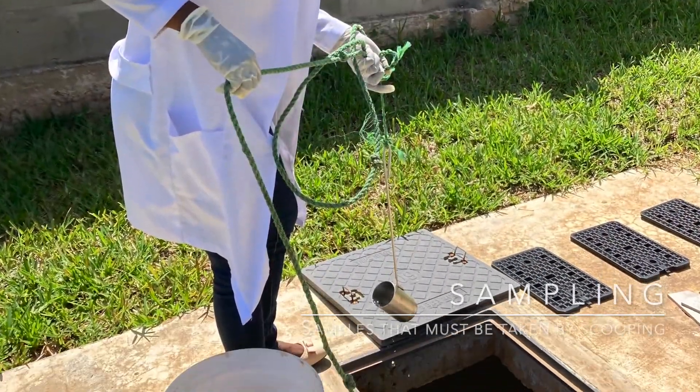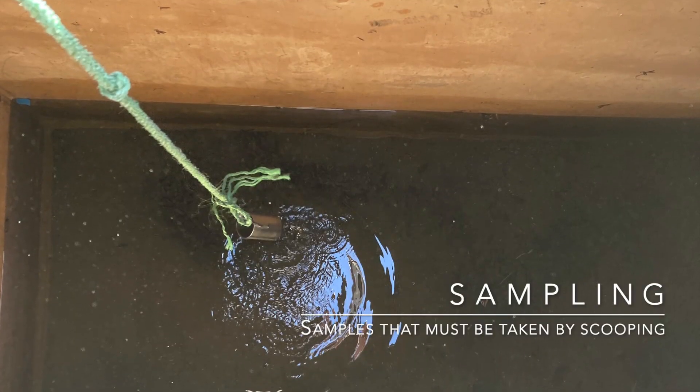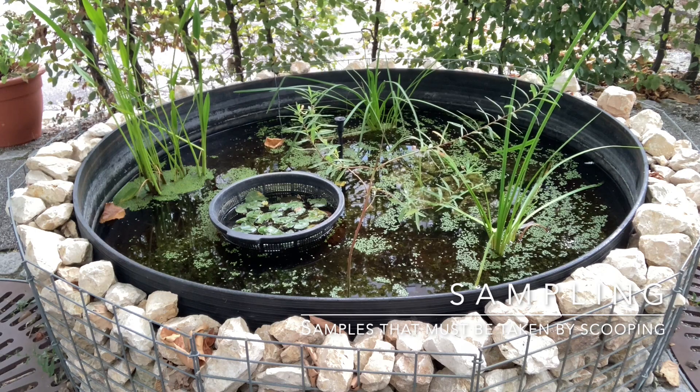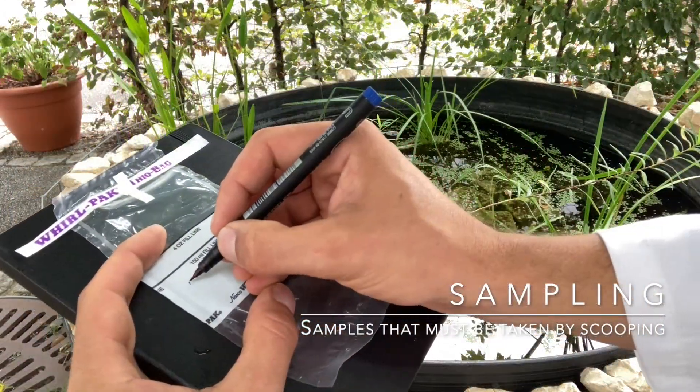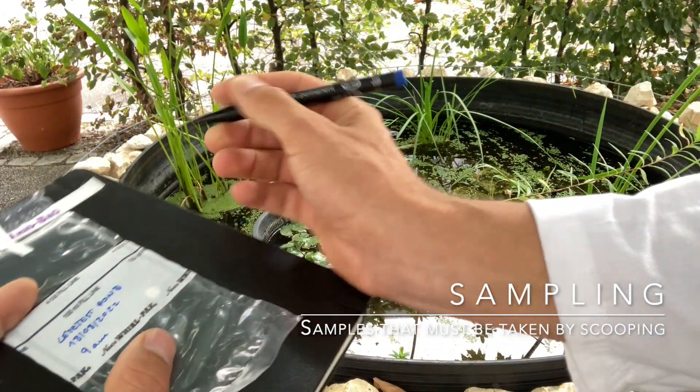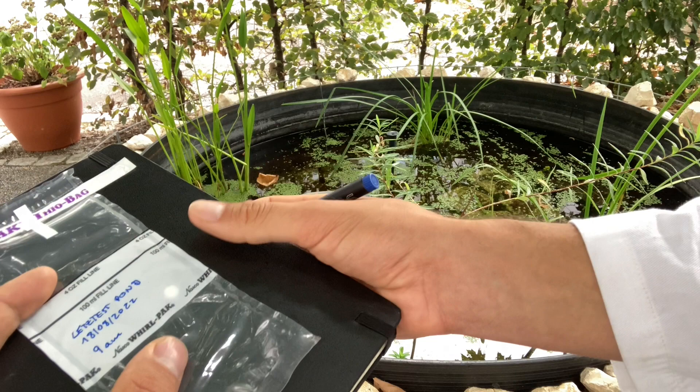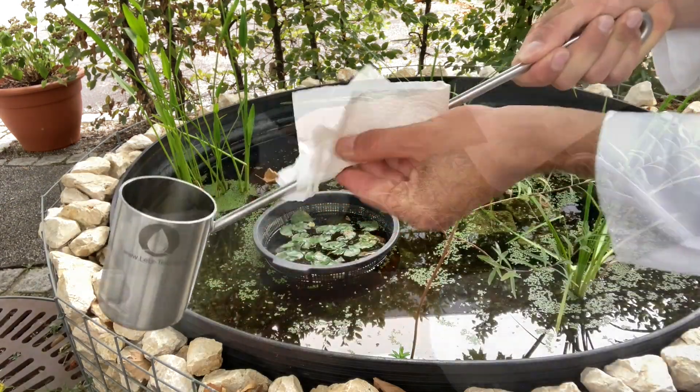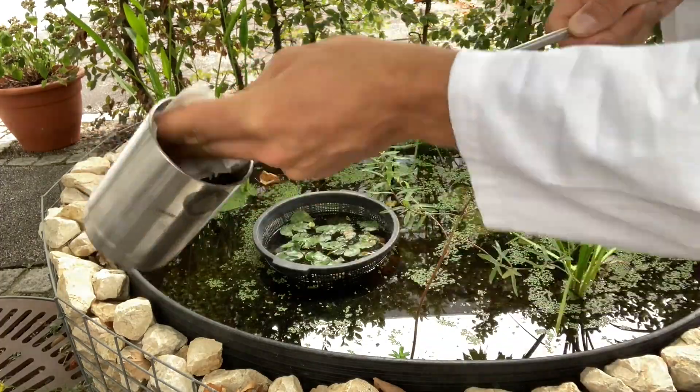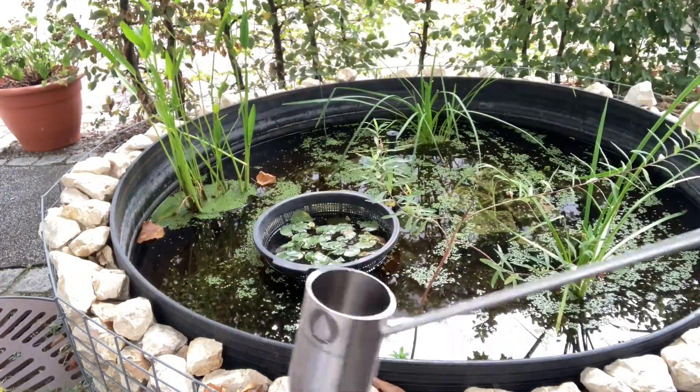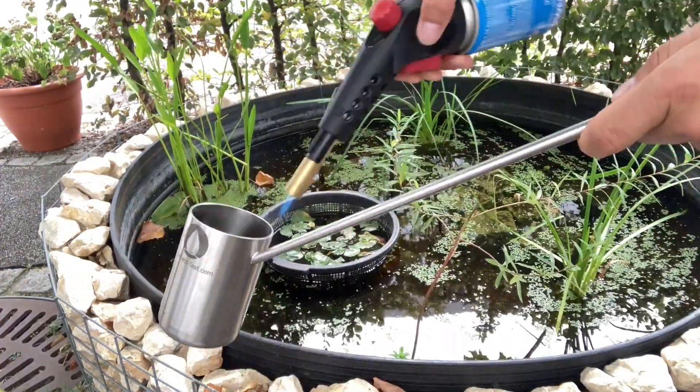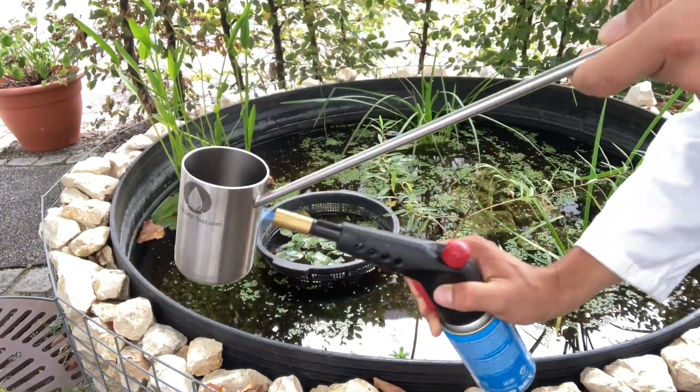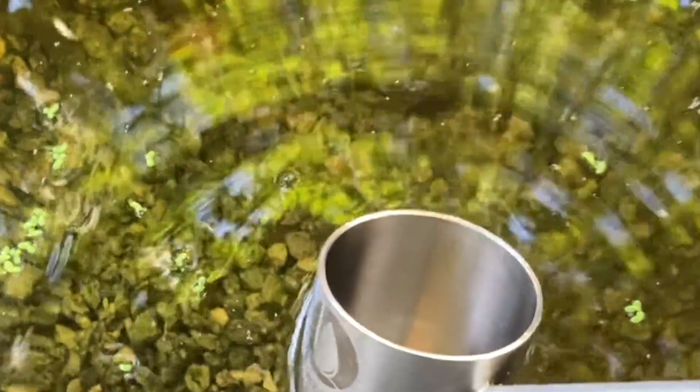When sampling at locations where the sample must be scooped, proceed as follows: Label the sample bag with ID, date, and time using a waterproof pen. Then wipe the critical part of the liquid sampler with alcohol. If possible, sterilize it with a Bunsen burner or wait three minutes for the alcohol to react and evaporate.